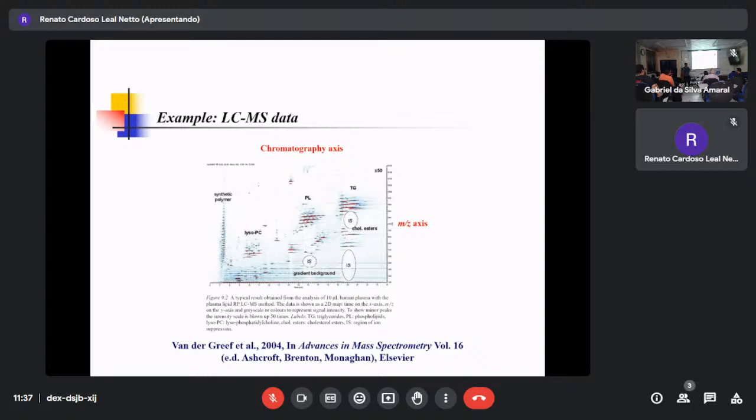You understand? Now we should think gradually about the statistics. Now you pick 300, it comes out. 300 is not enough. When it comes out in chromatography, 1 minute 300. His name is 1 minute 300. Your name is 2 minute 300. Something like this one. So that's why now we are using two names, yeah, two names, surname and first name. This one, two names.